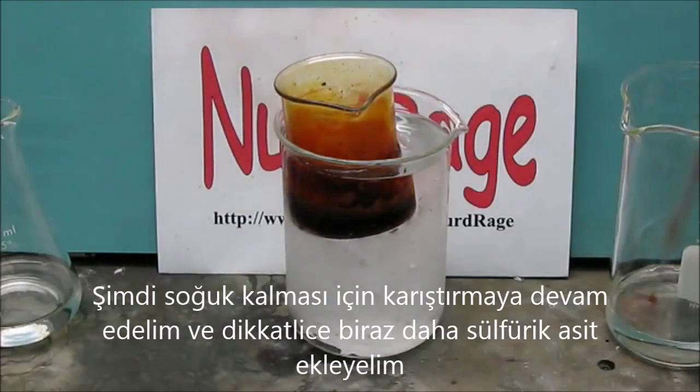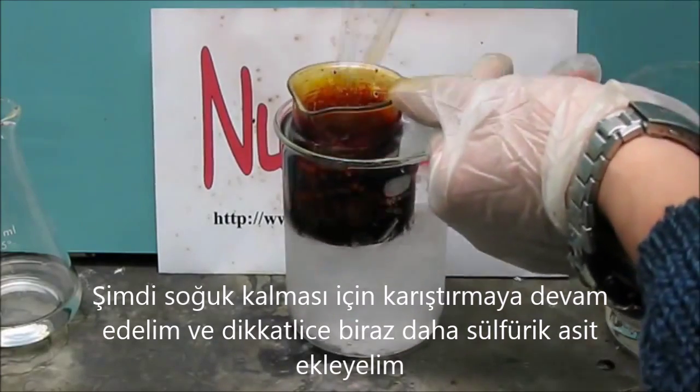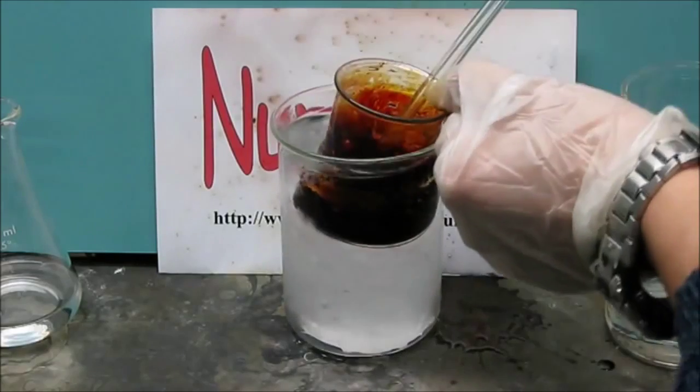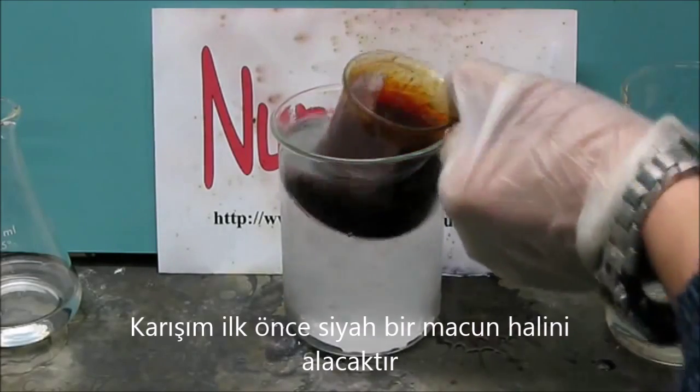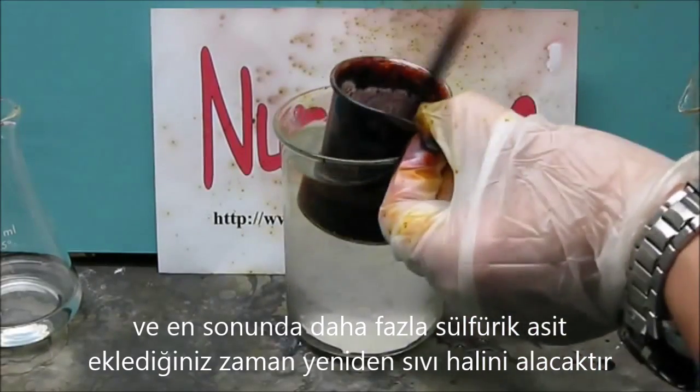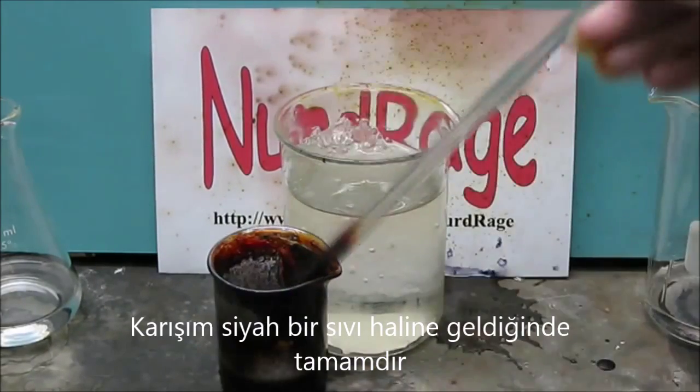Now keep it stirred to cool it and carefully add more sulfuric acid. Do this outside or in a hood, because the gases produced are toxic. At first the mixture will become a black paste and eventually will liquefy again as you add more sulfuric acid. When it becomes a black liquid, you're done.